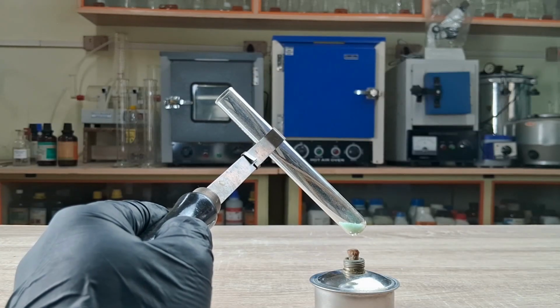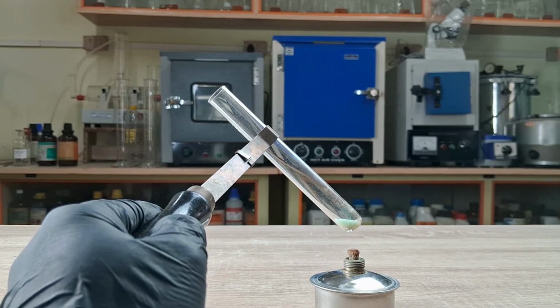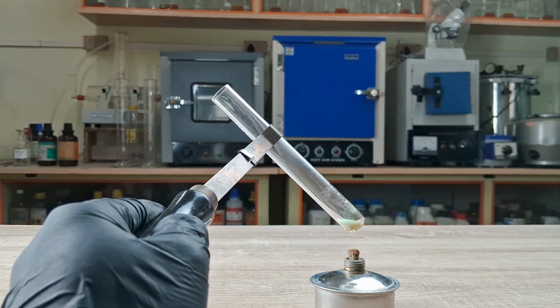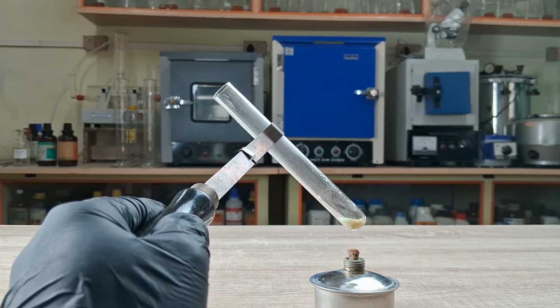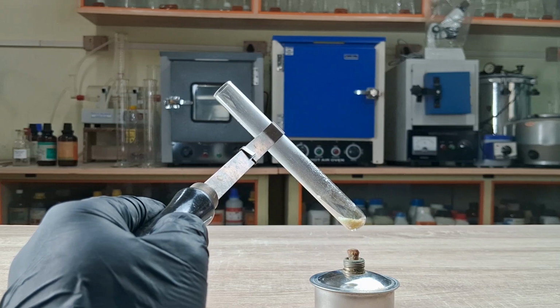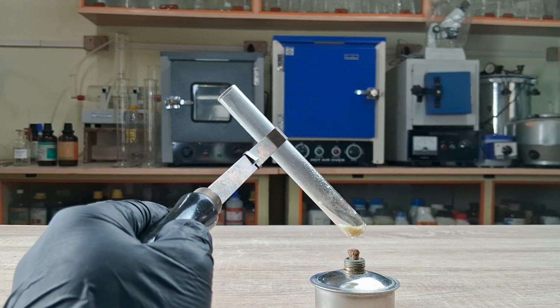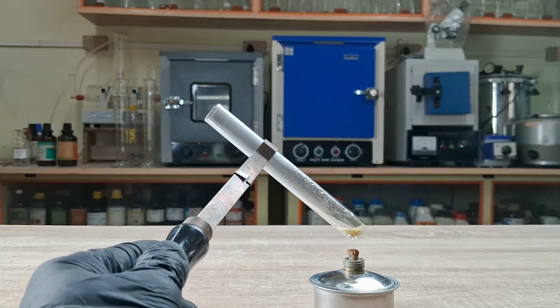As you heat the green ferrous salt in the tube, it initially turns from its original light green color to a white or pale green. Water vapor is also seen to condense at the upper ends of the test tube. As you continue heating the salt long enough, the white color gradually changes to a brown or reddish-brown color. At this time, you can also see an emission of colorless to faint cloudy white fumes of a gas from the salt in the tube.